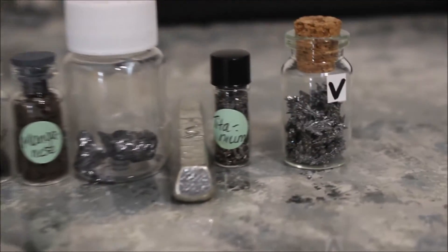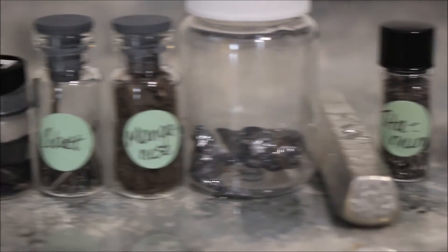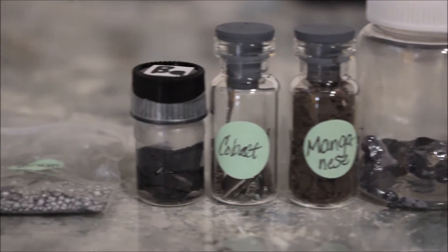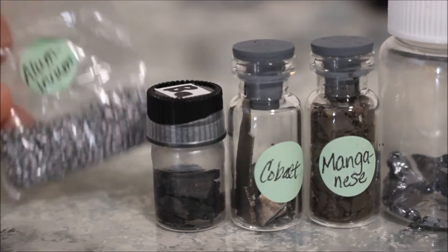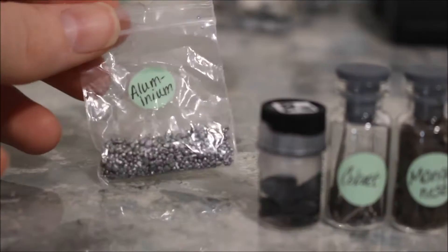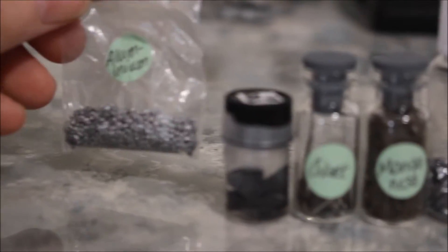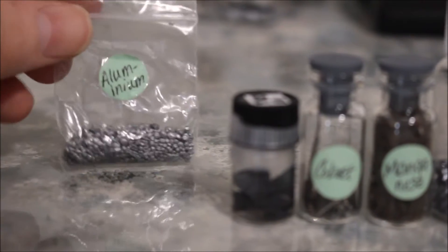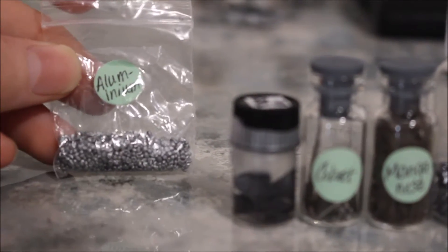First, let's look at the new element samples that I bought. First up is some aluminum granules. I actually got this as a bonus sample because I ordered a few, as you can see over on the right. These are just some granules, and I don't really know how to show it in action.